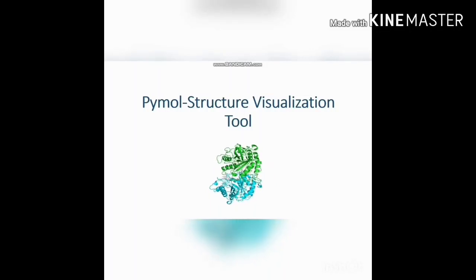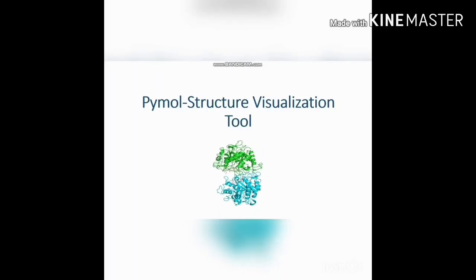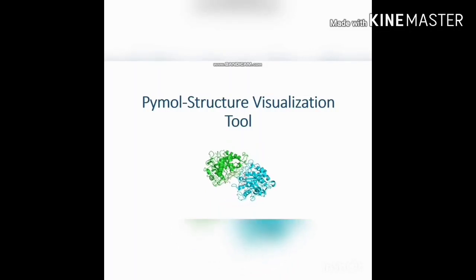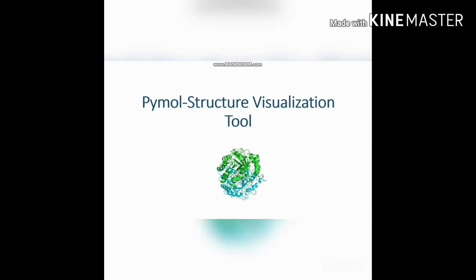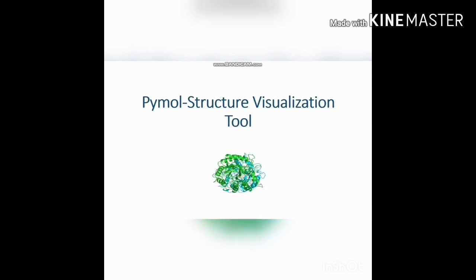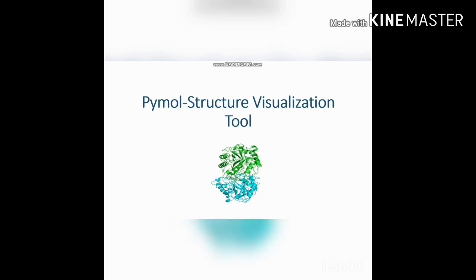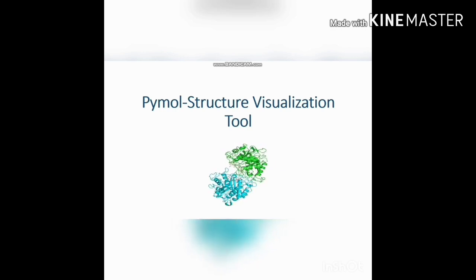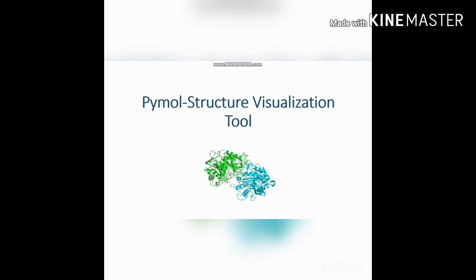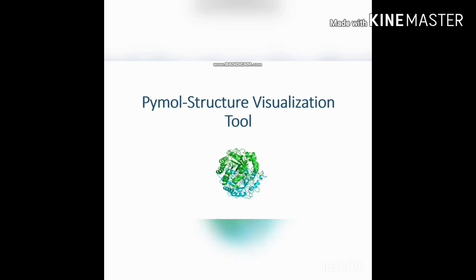Hello everyone. In this video I am going to explain about PyMOL. It is a structural visualization tool to visualize the 3D structure of protein molecules or any kind of macromolecules. It produces high quality 3D images of your protein or such macromolecules. Let's see how the tool works.